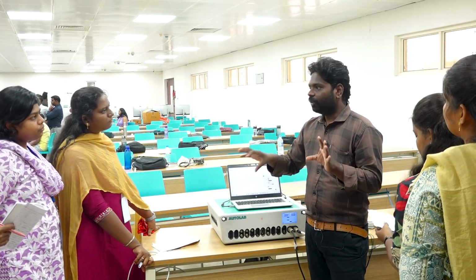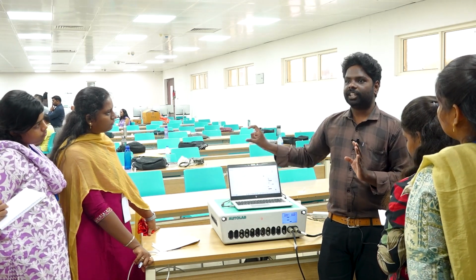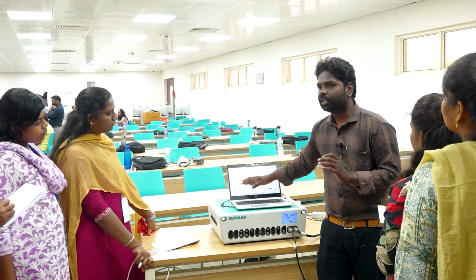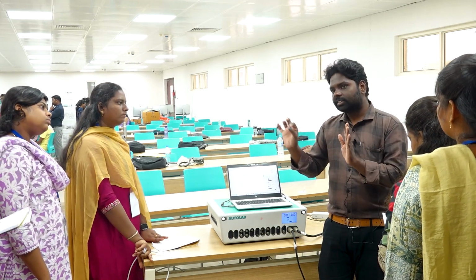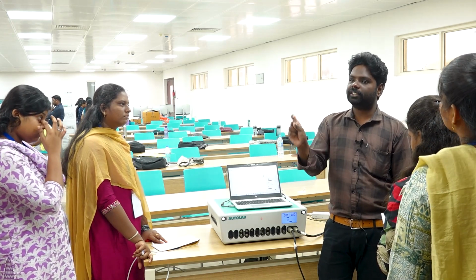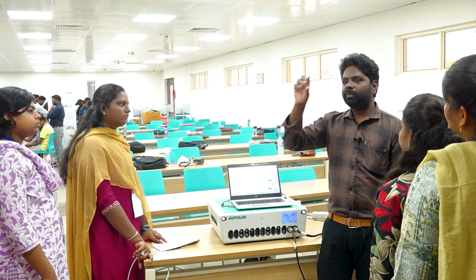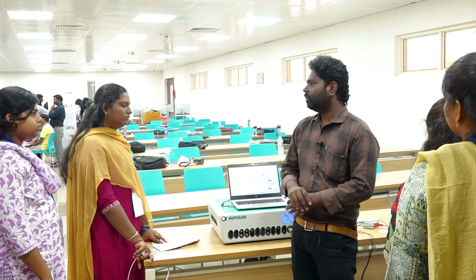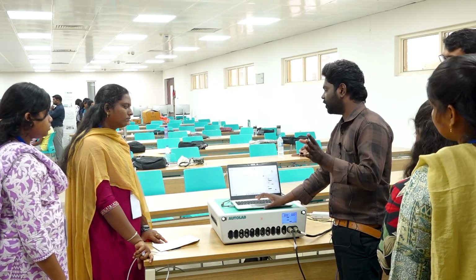We are going to draw an equivalent circuit. That means we are going to draw a circuit which should be exactly equal to this. Once you make the equivalent circuit, we will get the values on the circuit itself. That circuit clearly tells you how much internal resistance is there, how much charge transfer is there, how much diffusion, that means capacitance, is there. So hereafter we are going to fit a circuit.